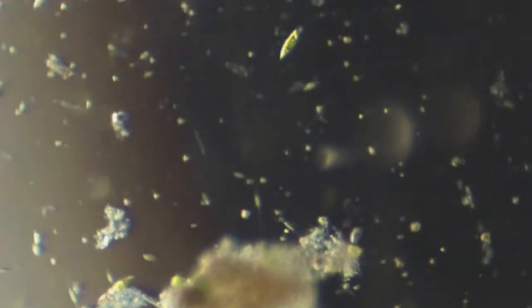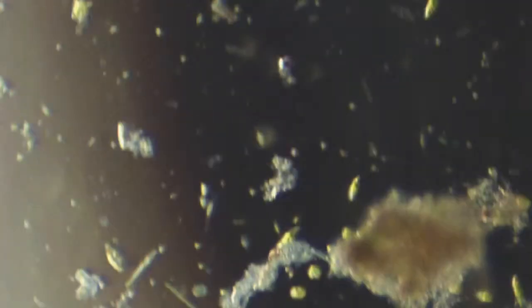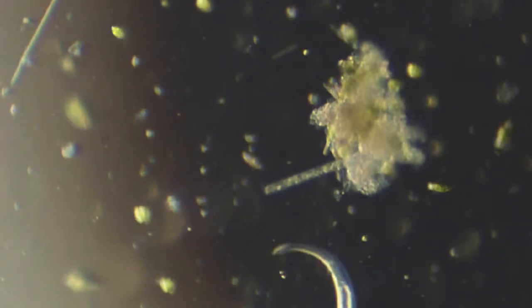So you can see it in the middle of the frame there, in and out of focus. Change the light levels a bit here. Now it's in the middle. But again, in and out of focus because it's a very hard thing to... They have too much up and down movement in this much water, so I gave myself too much work to do here. So you can see how fast they are. They're really hard to follow. There's a nice nematode. Just hang on that for a bit. Well, it has its little fit.